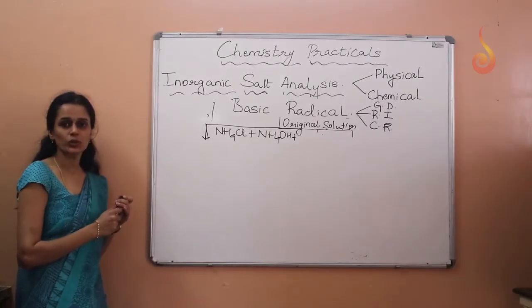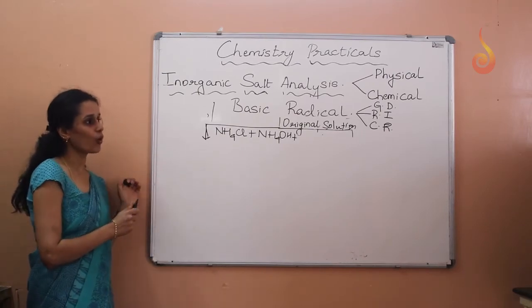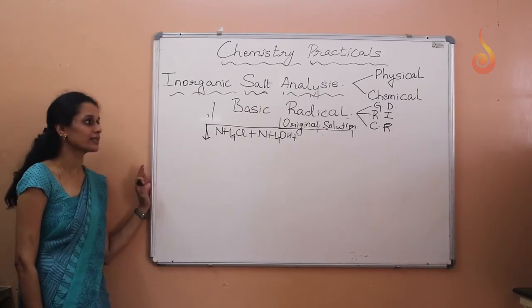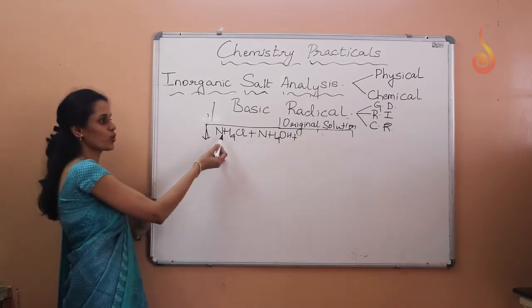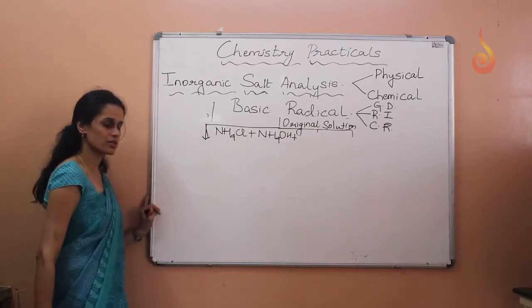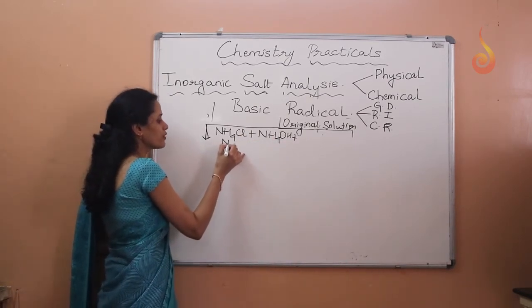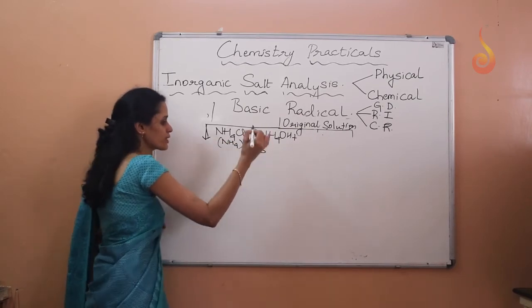To the original solution, we add ammonium chloride crystals, then ammonium hydroxide solution, and then ammonium carbonate solution.